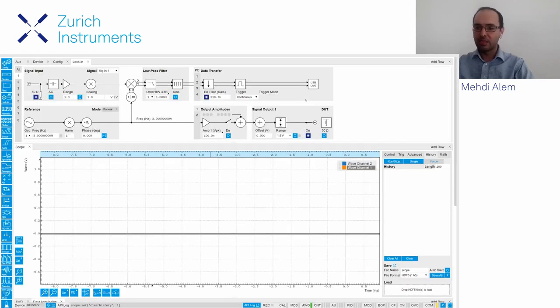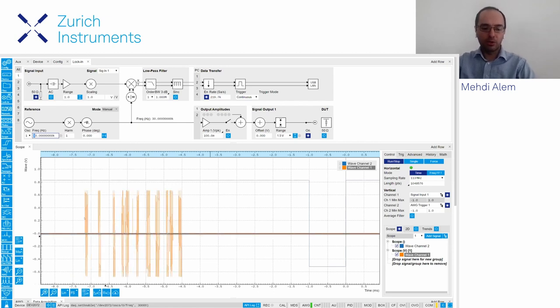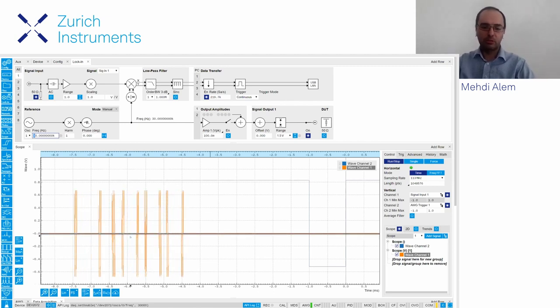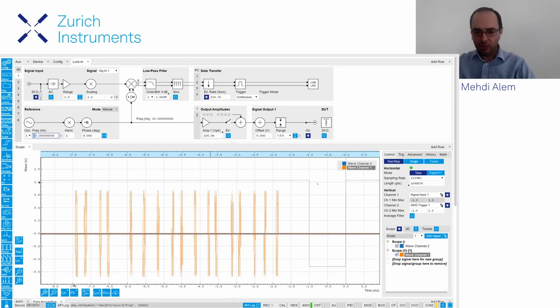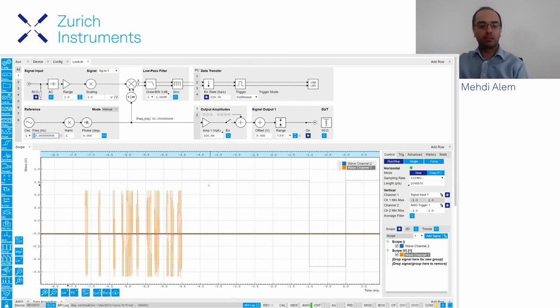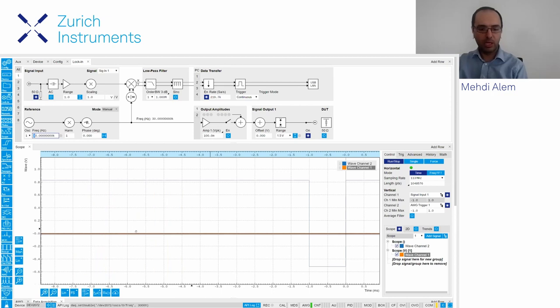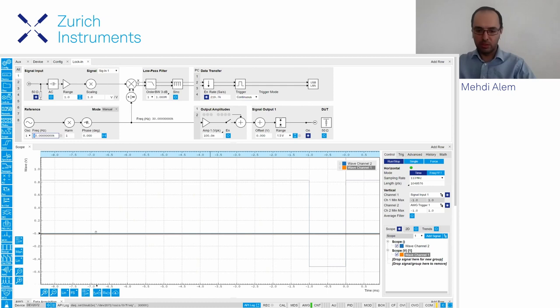In the oscilloscope I'm looking at the signal received at the input of the lock-in amplifier. This is exactly the signal usually coming from your AFM. Depending on this trigger signal coming from your AFM — which represents your end-of-line measurement — you can synchronize the acquisition. This signal is modulated, and for each line you have different signal shapes depending on the sample.